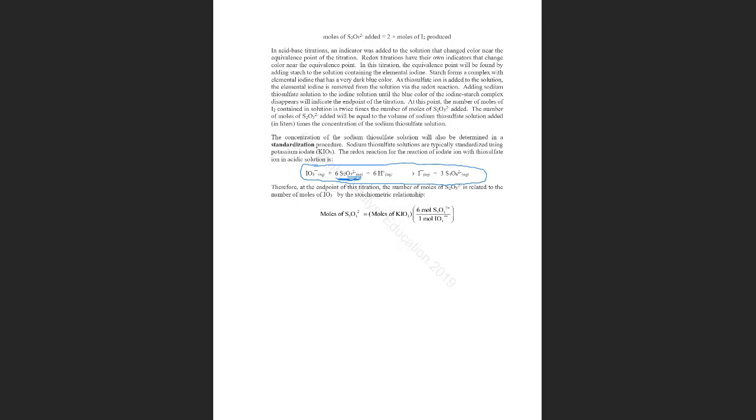And again, what happens? Again, we add an excess of potassium iodide to produce iodine. At the beginning without the starch, you will see a yellow-brown color. And then when you add the starch, it will be a dark blue.